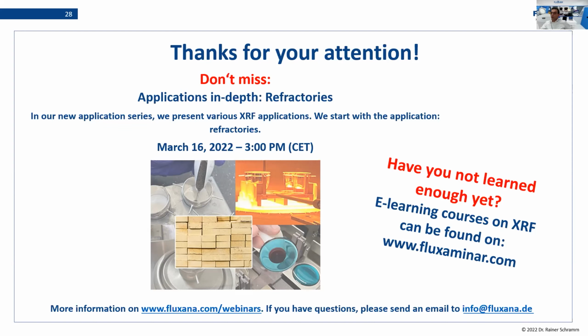Another question: don't you follow the principle of the theory of sampling when you take samples? From your explanation, it seems you are actually just point sampling. Yeah, that is right. What we do is try to capture the complete inhomogeneity in that material. However, we assume from the beginning that the material is homogeneous, because when we find real inhomogeneity, then this material can't be used anyway.